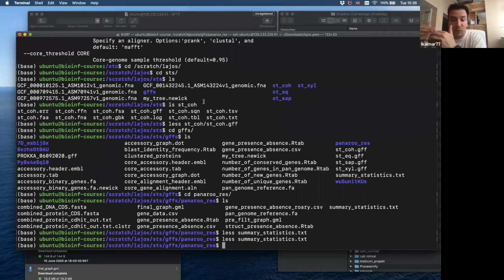Here we are going one step up, so you can do core genome based comparison within species between strains. I think that's one of the best ways to distinguish between strains, sequence types or clonal complexes. For that purpose, I think the core genome alignment is one of the best ways to go. But I would go even up to genus level. For example, what we did last time, we took 4 different species from the same genus. This is again what you can do.